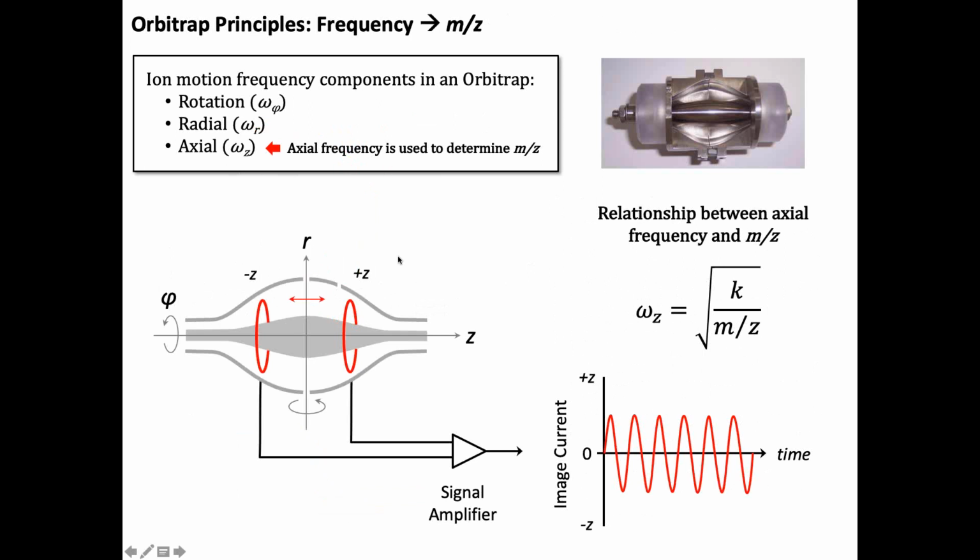And so as I said before, in a TOF type system, the thing that defines the resolving power and impacts the ultimate mass accuracy is the kinetic energy distribution. The kinetic energy needs to be really, really tight so that you don't have a lot of distribution, and everything's pretty much sitting at the same kinetic energy, and you're measuring the differences in the time of flight. Once they reach the detector, they smack into it, it's destroyed.